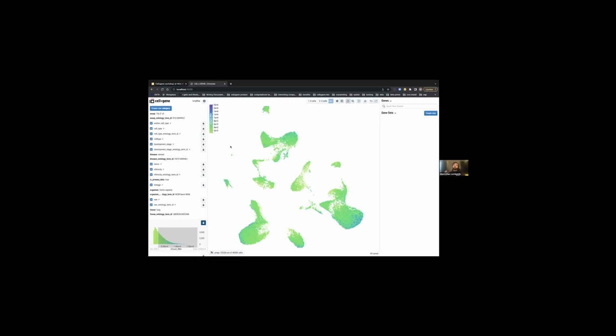You will need to download the AnnData H5AD. If you already have a Seurat object for an experiment that you're working on, there are solutions you can use to convert that Seurat object to an AnnData object. Pablo, if you could link SC Easy in the chat, thank you very much, I'd appreciate it. Good question, Daniel. All the same functionality is there.